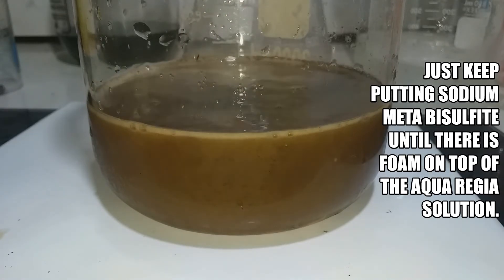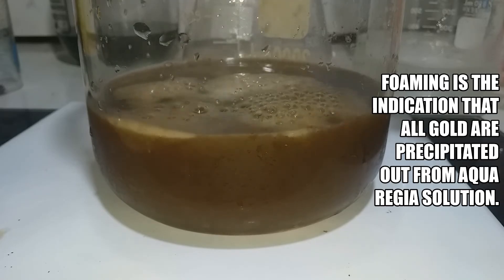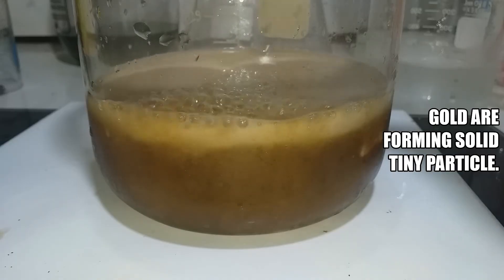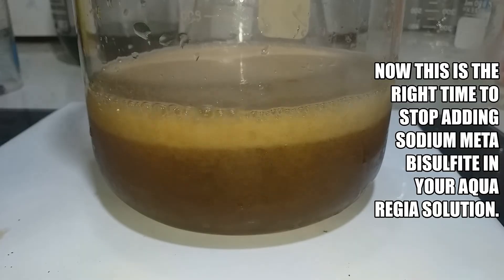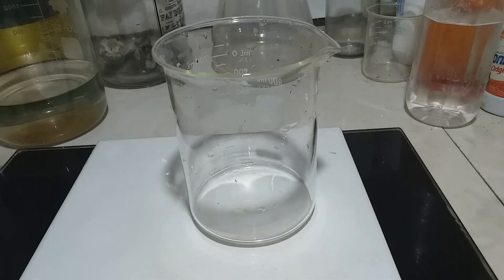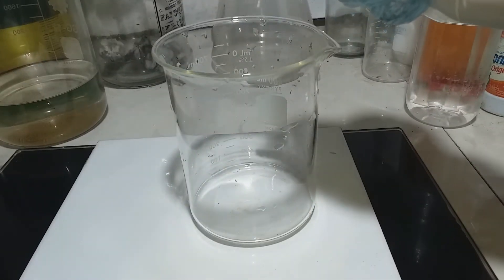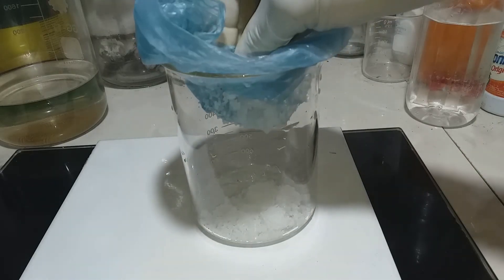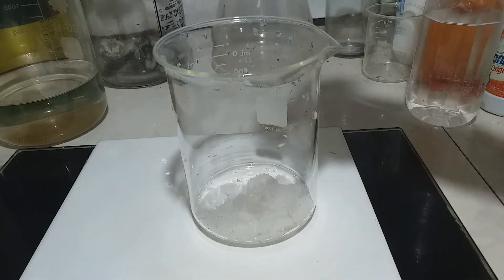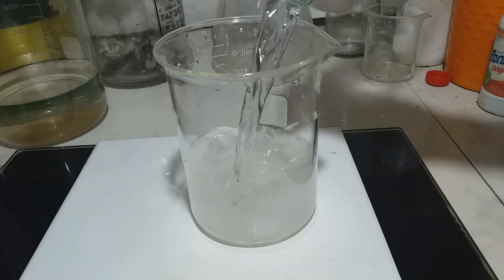That is the indication that we got perfect precipitation. This is what I do — this is your fertilizer, urea. What I am doing here is to put it into the beaker, then add water and dissolve it.